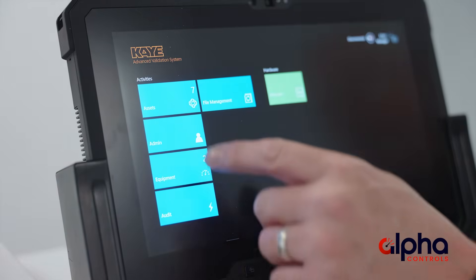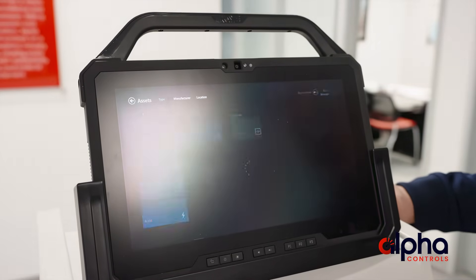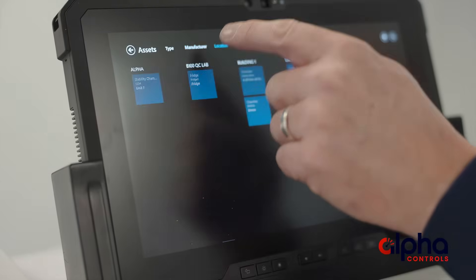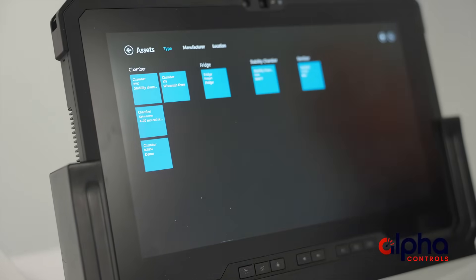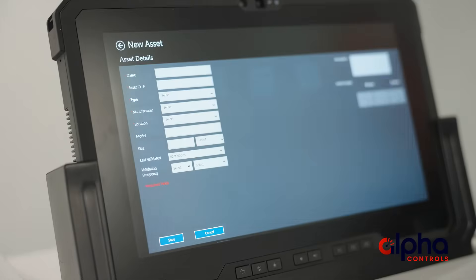There are sections for assets, admin, equipment, audit, and more. We're going to go into the assets tab, and this is where you're going to see all your different assets. You can store all these for future use, or if you'd like, you can start up a new asset with a new study by hitting the plus button in the top corner.